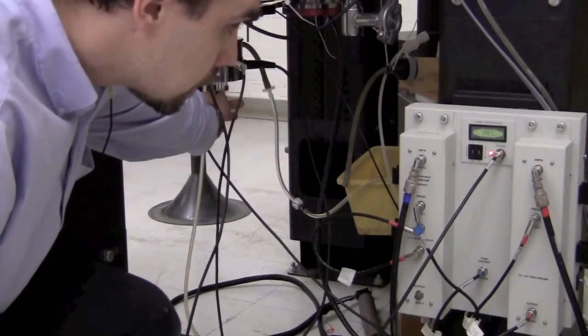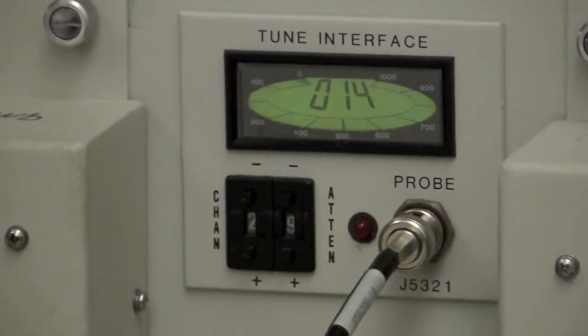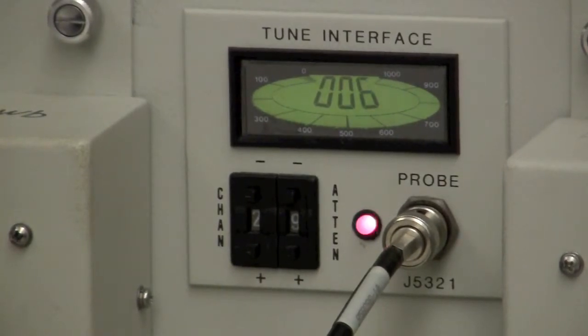Adjust the match until it gets as low as possible, then adjust the tune a little bit, and go back to the match to see if you can do better. There is a single optimum that depends on both tune and match. Ideally they would be independent, but unfortunately the two interact — as you improve one, it makes the other a little bit worse. You want to make the overall number as small as possible.